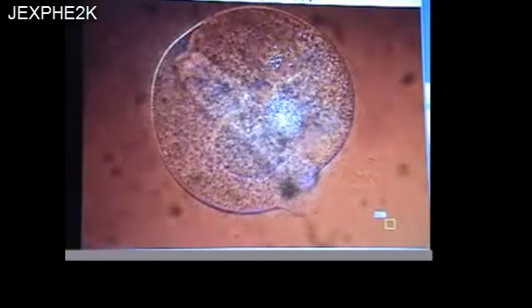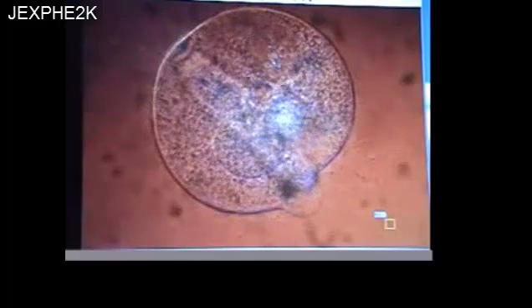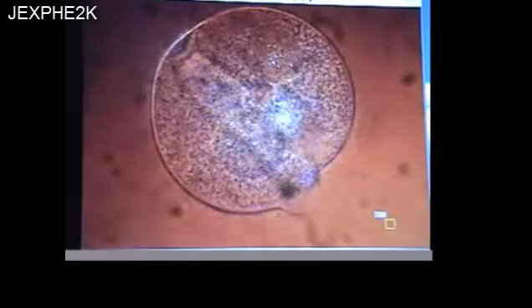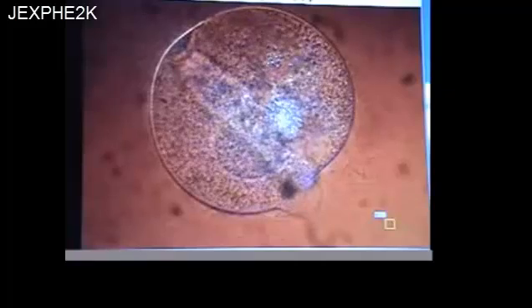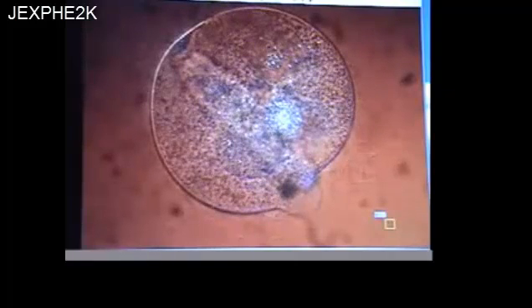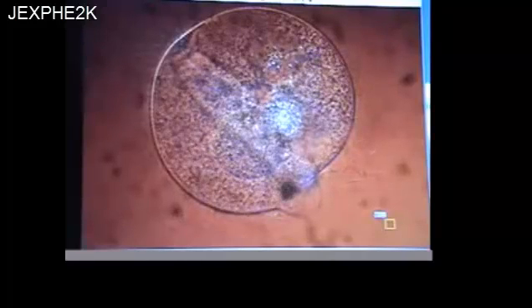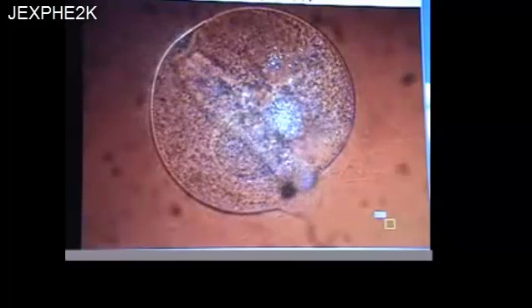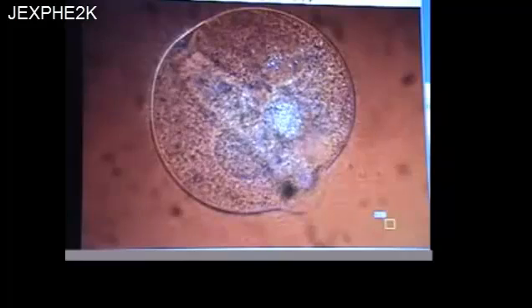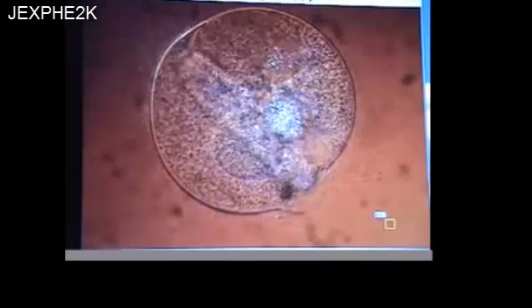Changing the light levels inside the microscope, trying to see if there's any hint that there might be an additional change. There is a lot of activity going on in this one spot. And we see a little wiggle, which usually indicates something's about to happen. Now, I think if we look at the bottom right of the organism, beginning to extrude and distend.